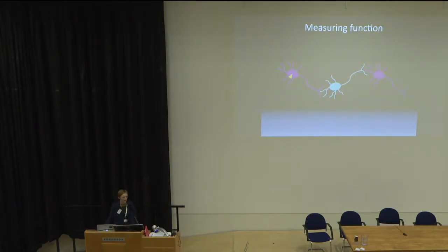So if we look at that in the disease state, we shine the light again and it sends a signal, but it might get stuck. So when we then look at the receiver cell, we don't see any signal there. So that means that we can really look at drugs that are preserving that essential function of neurons, of being able to communicate with each other.